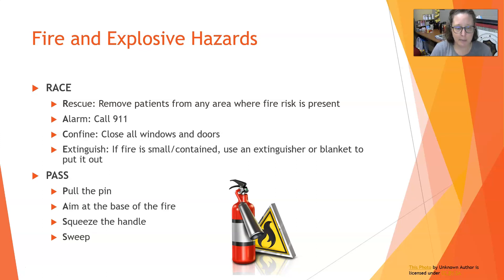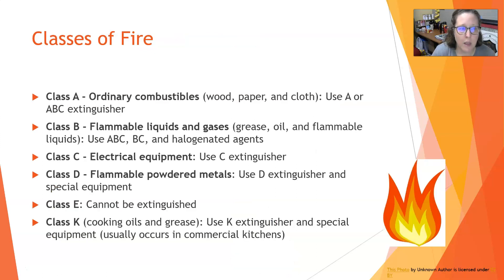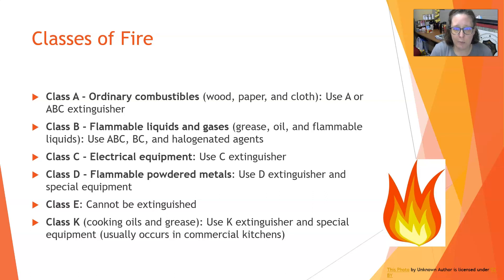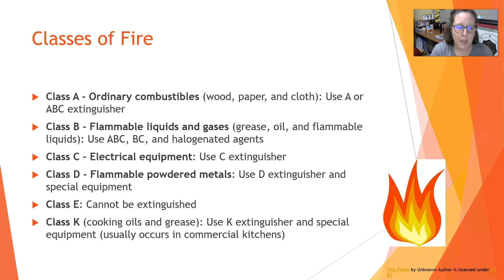The PASS acronym describes how to operate a fire extinguisher: Pull the pin, Aim at the base of the fire, Squeeze the handle, and Sweep back and forth. Fire classes: Class A are ordinary combustibles — wood, paper, cloth — use an A or ABC extinguisher. Class B are flammable liquids and gases such as grease, oil, or alcohol — use ABC, BC, or halogenated agents. Class C is electrical equipment — use a C extinguisher. Class D is flammable powdered metals — use a D extinguisher with special equipment.